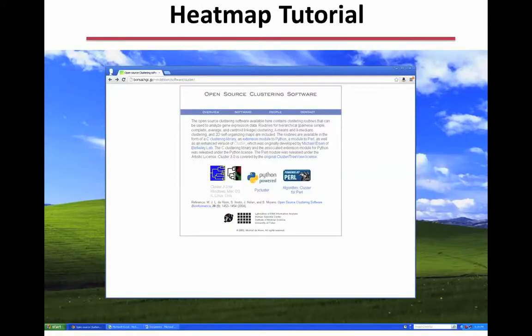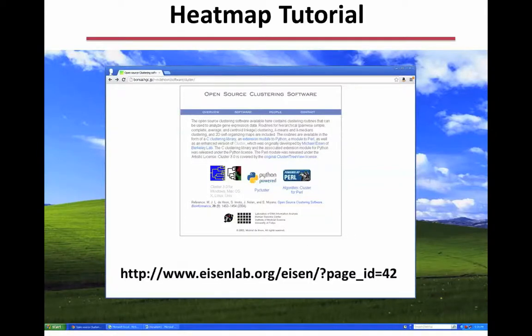So I thought it might be useful to give a brief tutorial on how we make these heat maps, and I like to use free publicly available software called Cluster and Tree View that were developed in Michael Eisen's group, and they can be downloaded from the lab website and used by anyone who's interested in making a heat map.